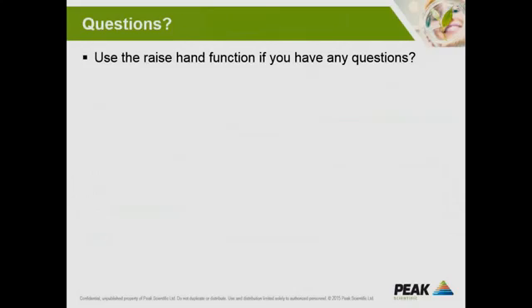The next question is from Mr. Narasimha again, asking what is the maximum distance between the generator and the GC for it to work effectively? Well, we'd normally recommend that the generator is located close to the GC application, within 10 meters, but ideally within 10 feet.